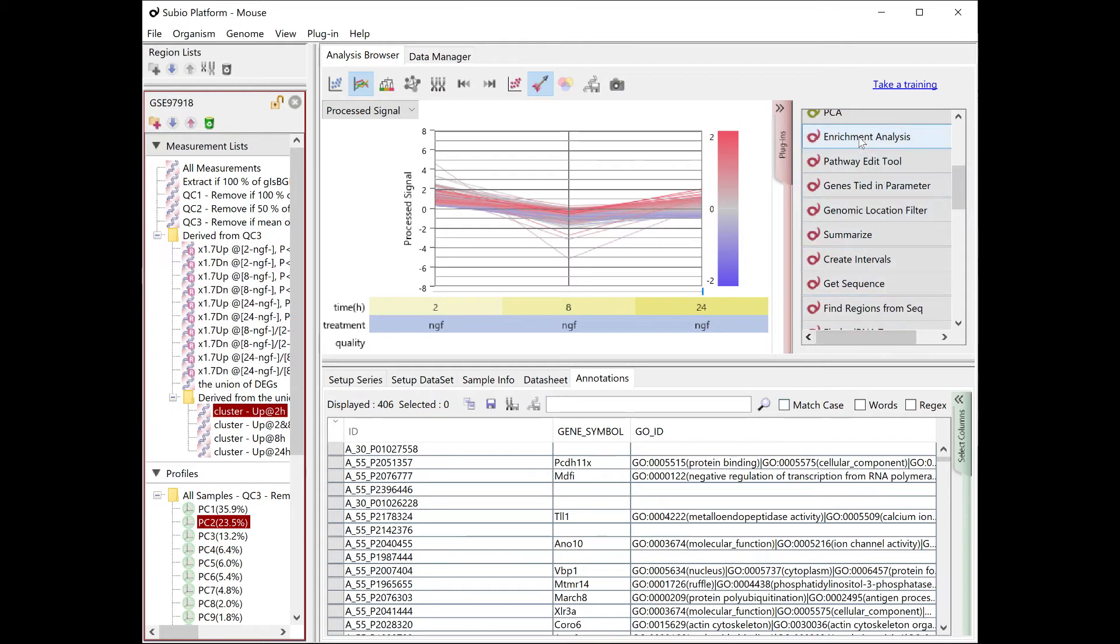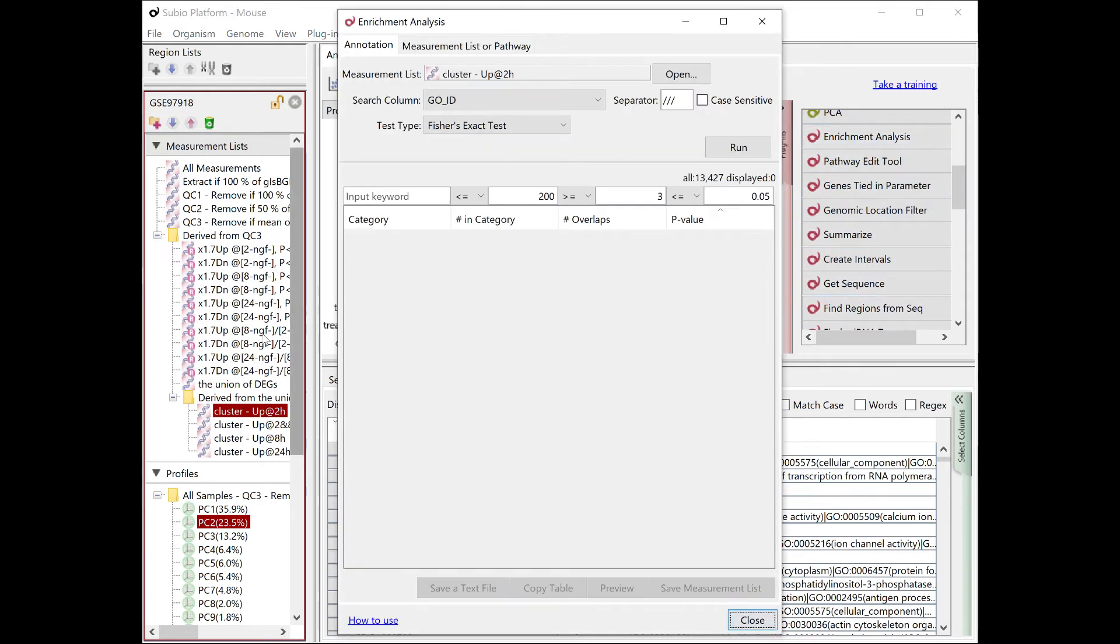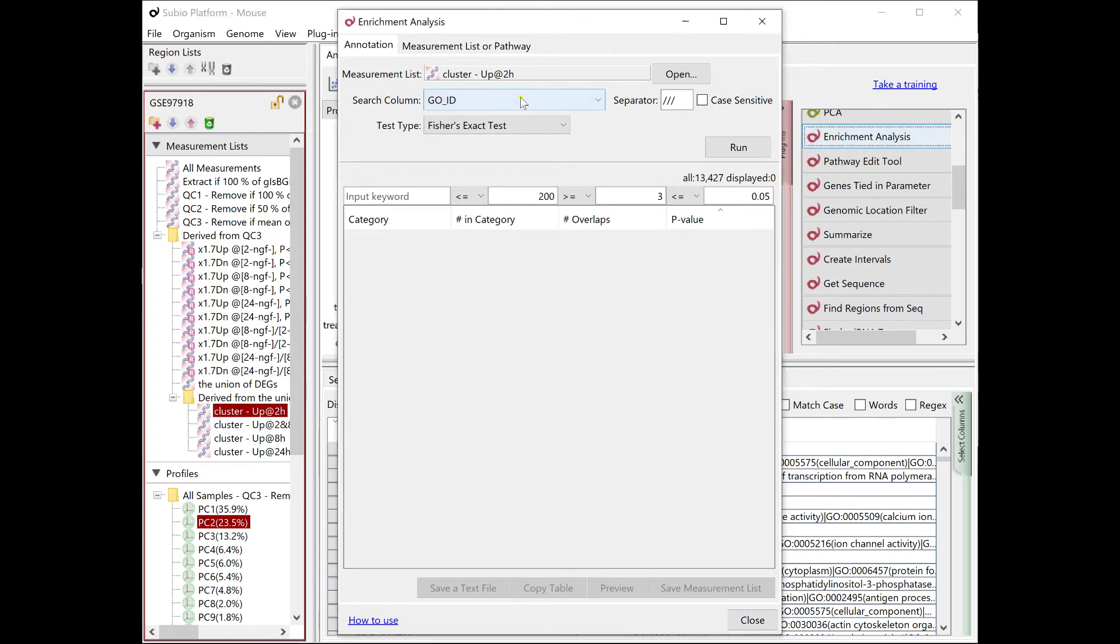The enrichment analysis tool can present the featured GO terms for clusters.